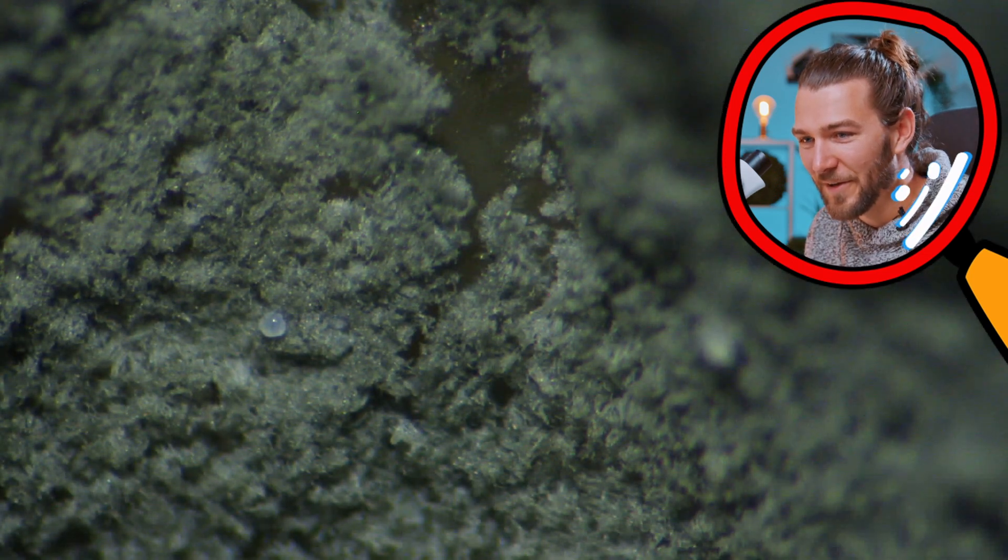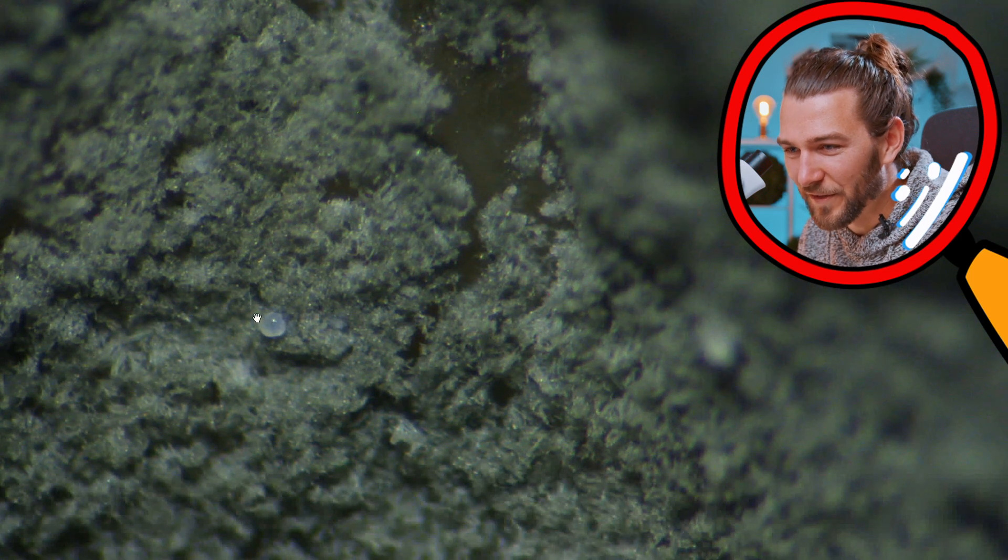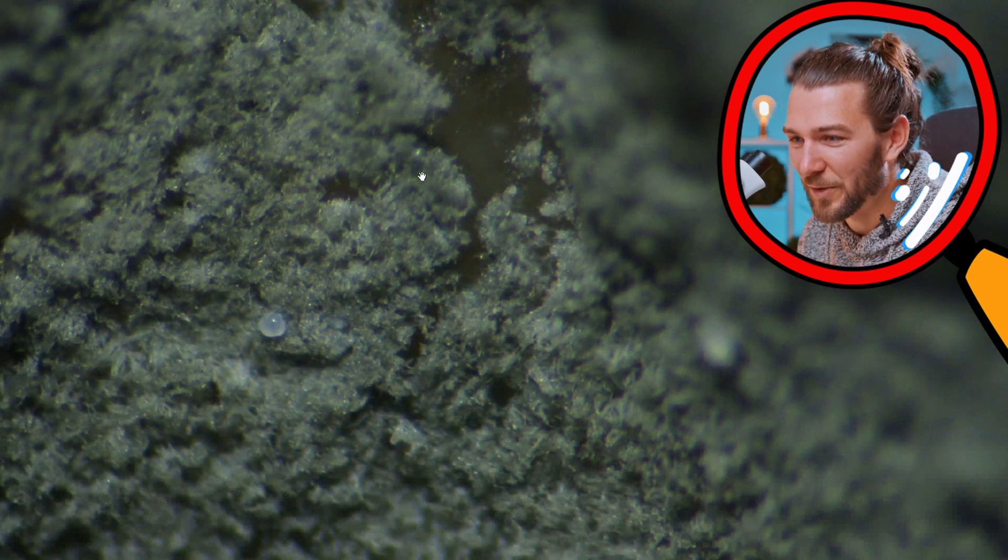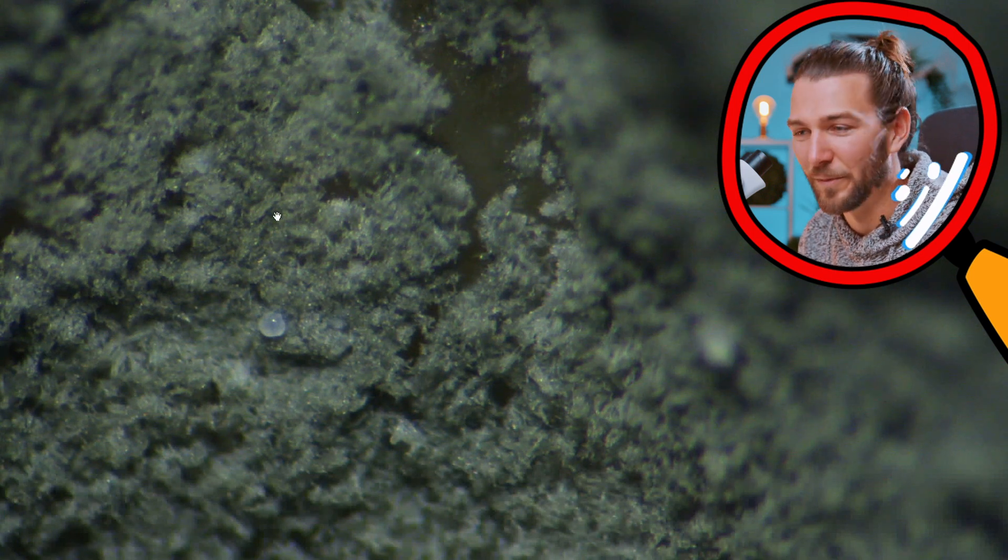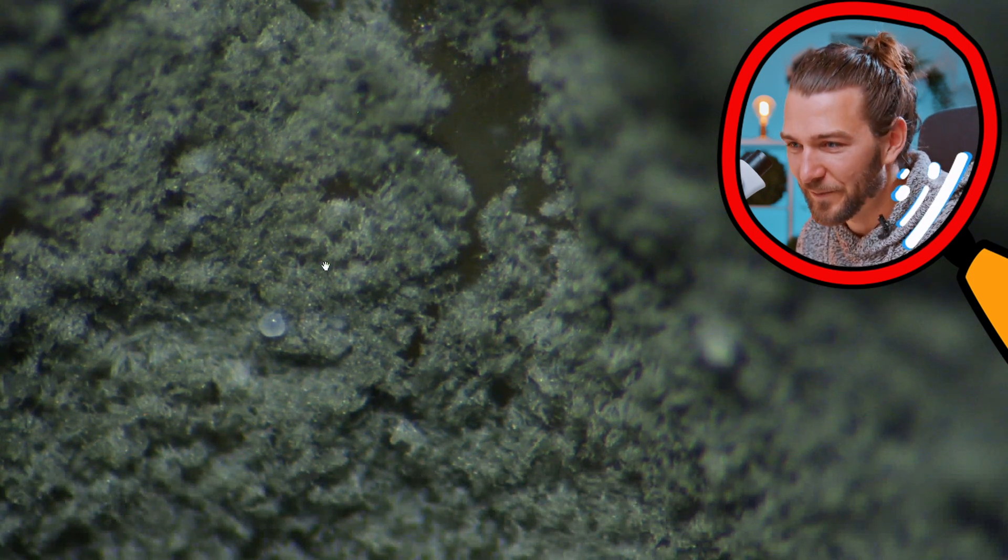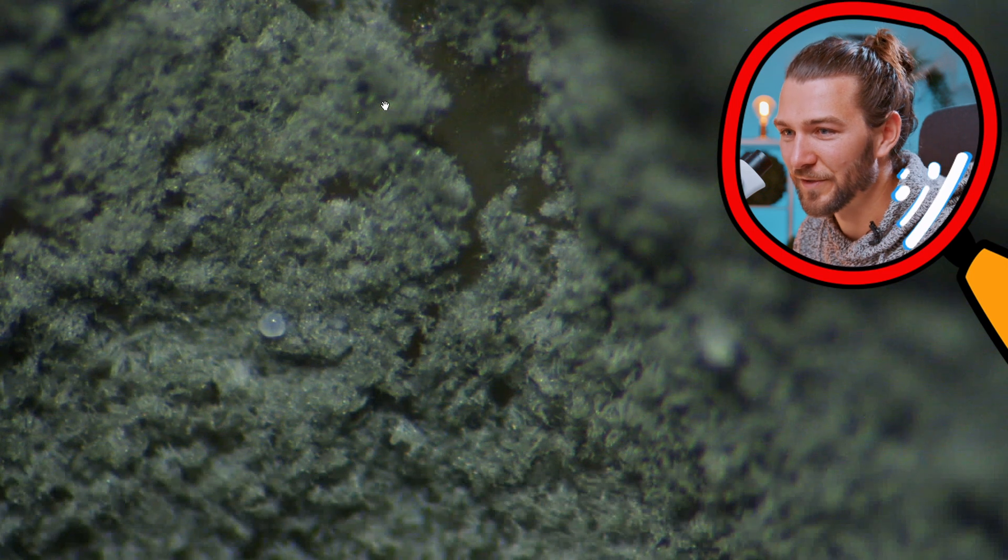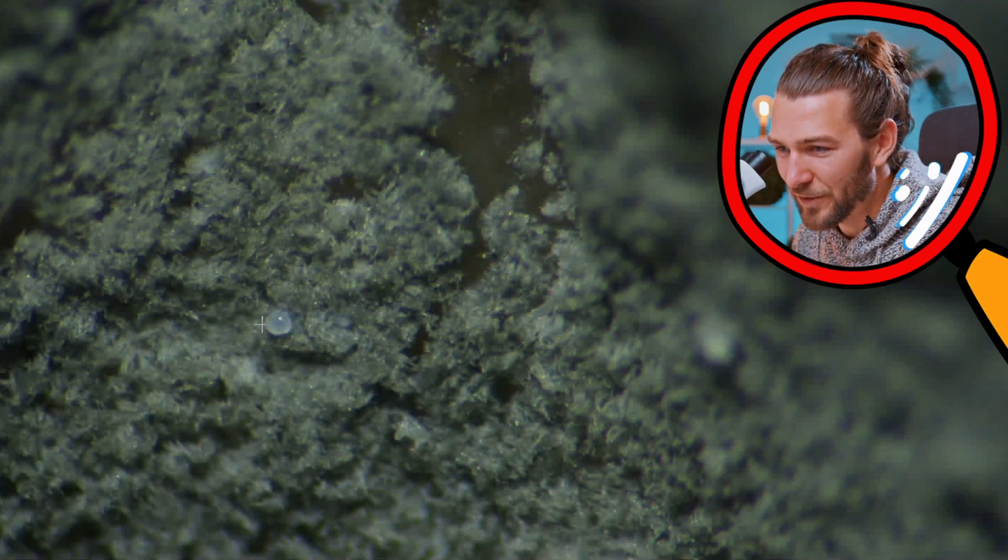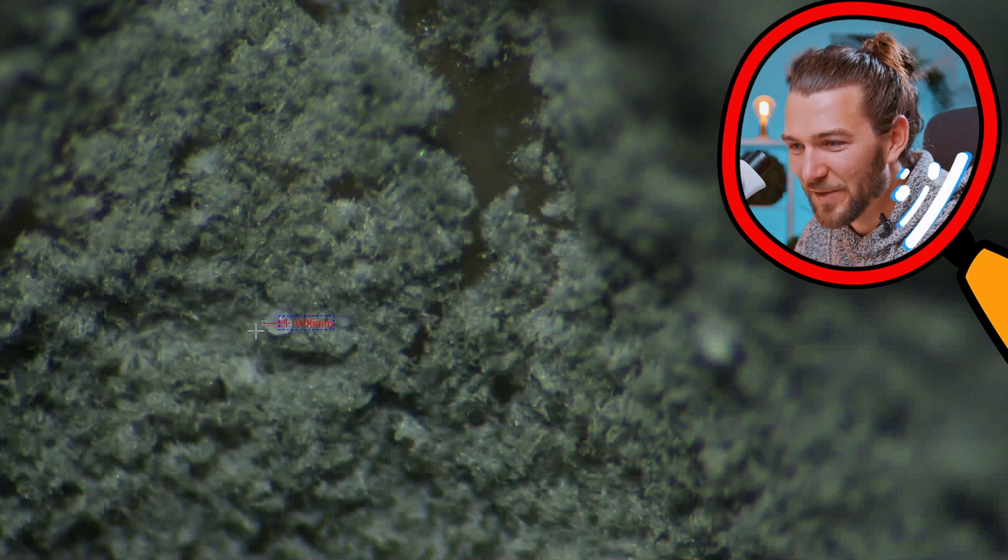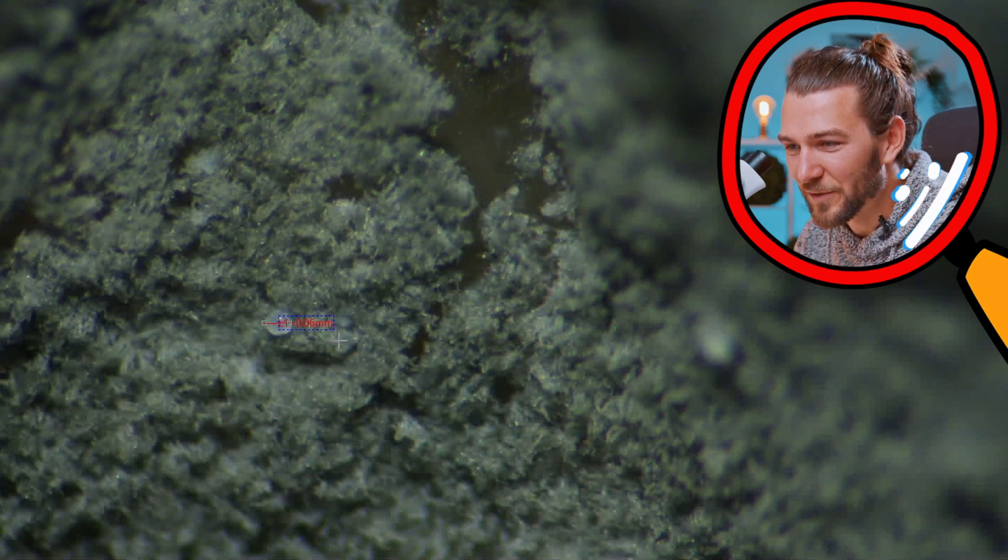The texture is like a crystal form, has little crystal forms. So let's maybe measure this one out. I can use my tool here. We can measure this ball. It's 0.06 millimeter, so super small.